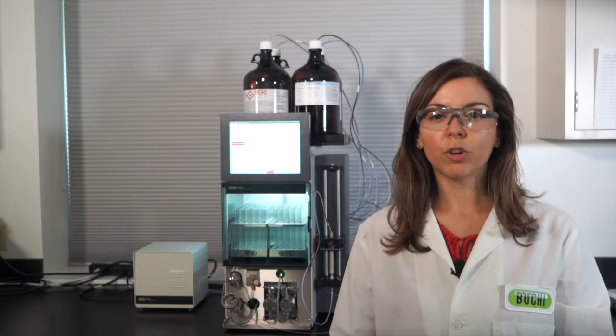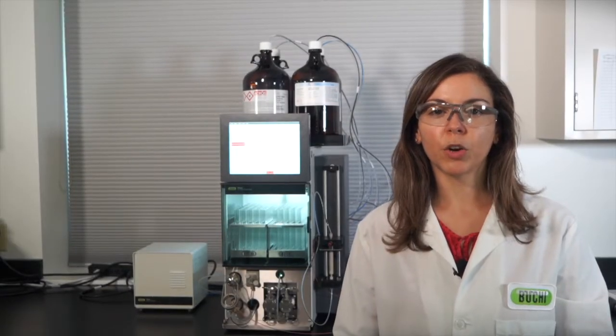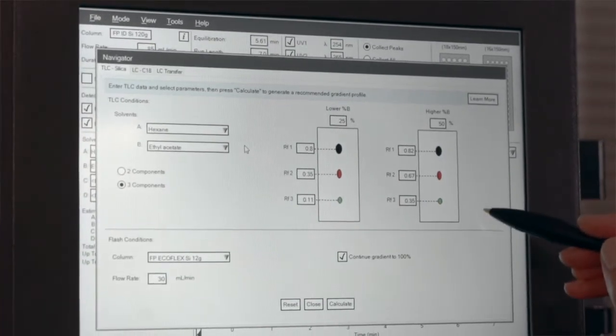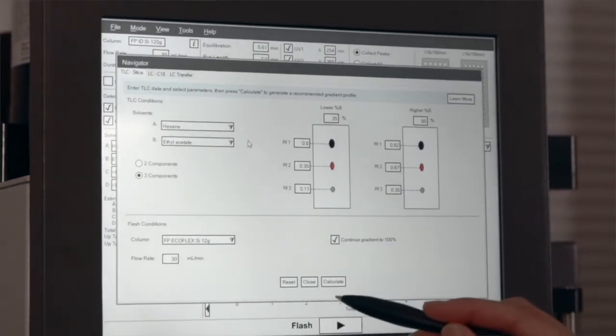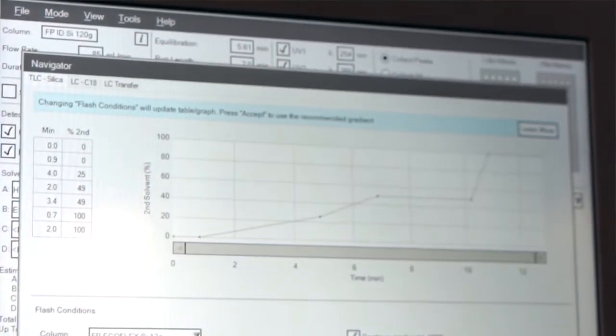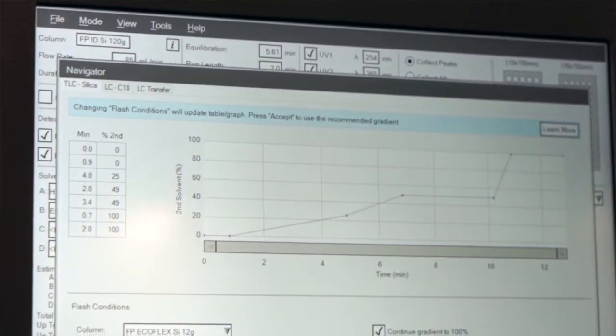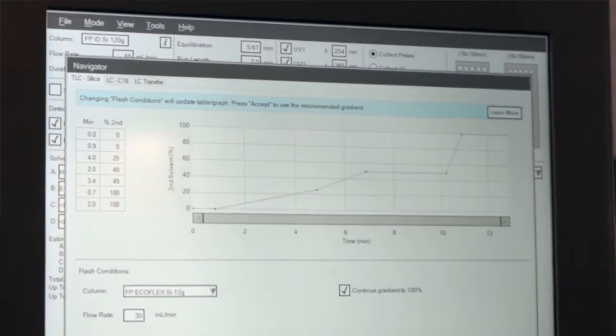If you have a new mixture where you need to develop a separation gradient, the Navigator software can provide a great starting point based on TLC runs or LC data. To use TLC runs, perform two runs at different solvent ratios and record the RF values. Input the percentage of the solvents and the RF values for each plate, select the desired cartridge, and watch the Navigator software effortlessly develop a gradient for your precious sample.